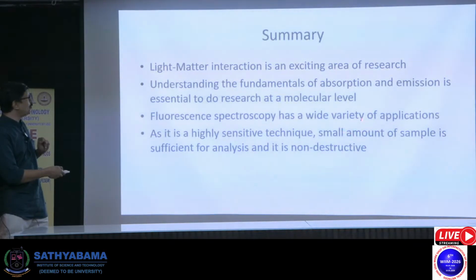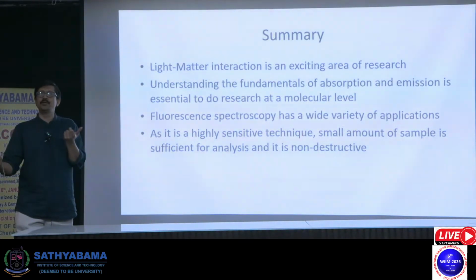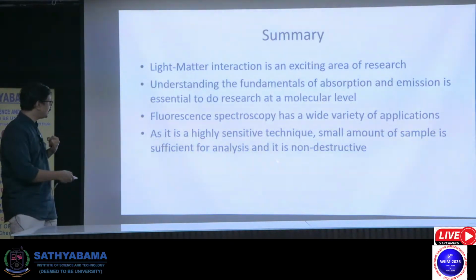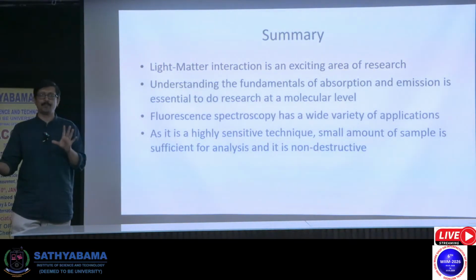Fluorescence spectroscopy has a wide variety of applications, and the two important things are: it is a very highly sensitive technique, so you need only a small amount. In my lab, people use 10 to the power of minus 6 molar solutions, 10 to the power of minus 10 molar solutions. You don't need much sample. That is one advantage. And it's a non-destructive method. You get the sample back. Nothing will happen. Most of the samples are not photo bleaching.